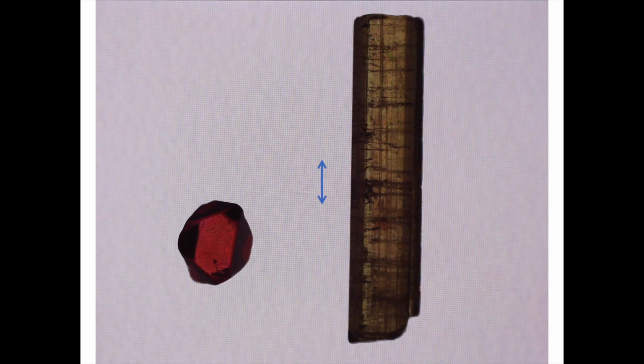And another way to think about this is that an isotropic mineral only has one refractive index. And so if we want to think about a diagram to represent that refractive index as we're looking at our spinel, for this singular viewing direction through our spinel, it would be a circle with a radius of refractive index n.